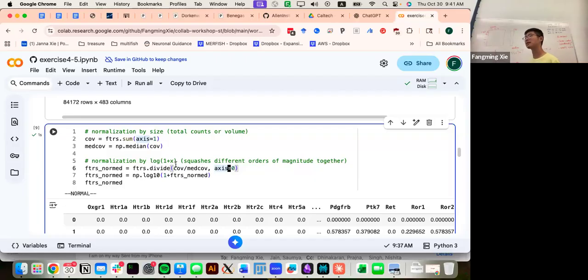So 500 is about 2.5 or so. It removes the influence of outliers by a lot. This is quite typical when you apply these algorithms, but you can also do without it to some degree if you remove outliers.